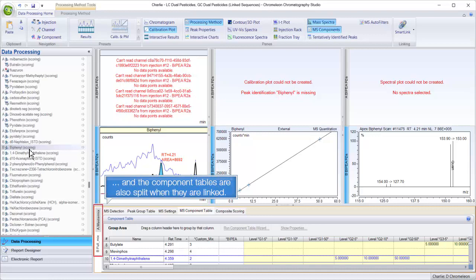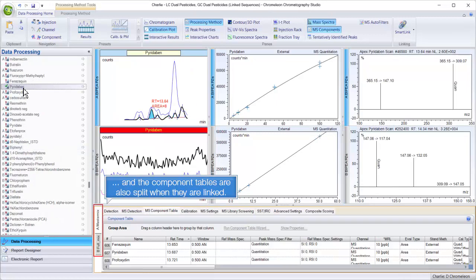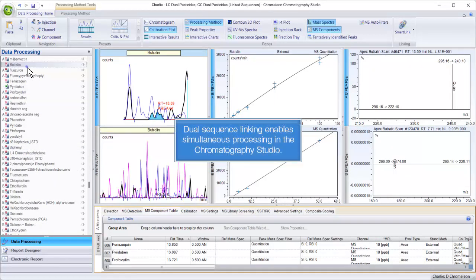The component tables are also split when they are linked. Dual sequence linking enables simultaneous processing in the chromatography studio.